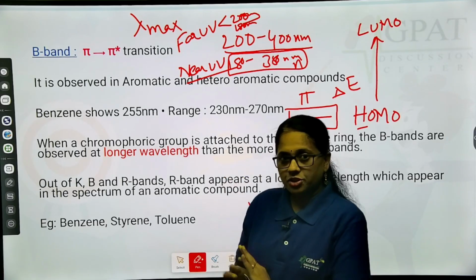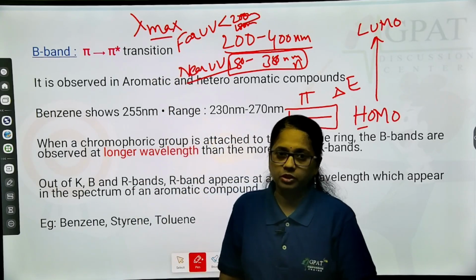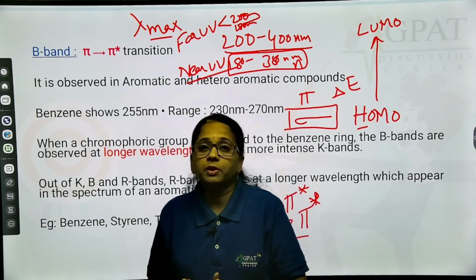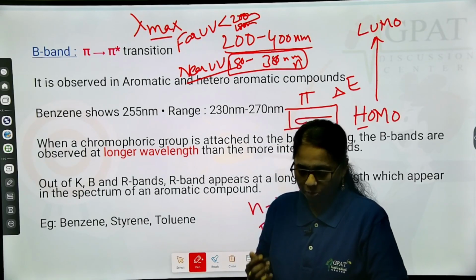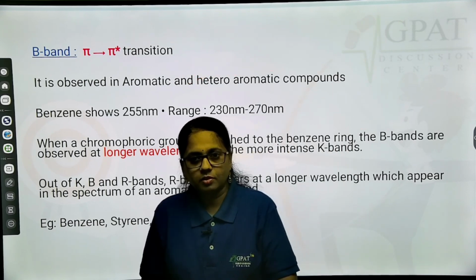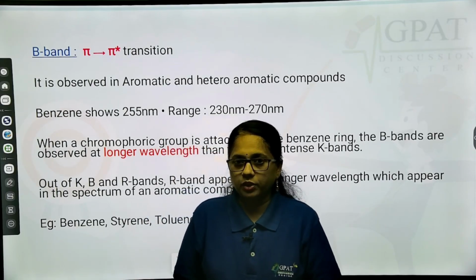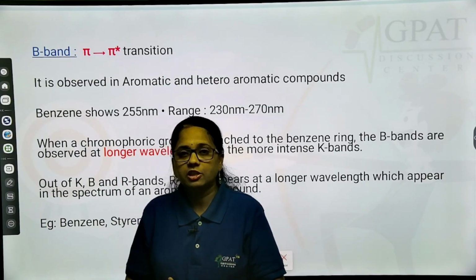From the electronic transitions, there is a significance of knowing the lambda max value, right. But the absorption bands, what type of information will we get from them? Let us first see what the different types of bands normally present in compounds are, okay. That means, in unsaturated compounds, whenever we give energy to any molecule, which type of absorption bands is it going to give, okay.